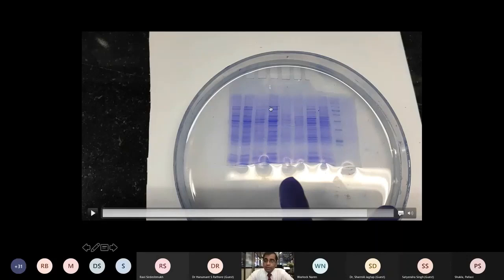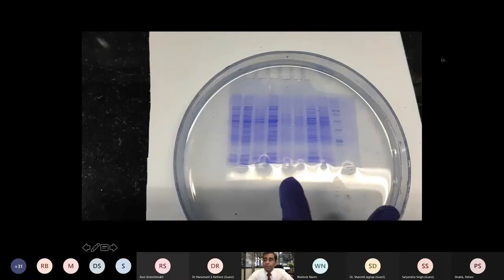As I said, I can make a lot of observations here: some of these extraction methods work very well, but this quantification is not good. This quantification is not good. There is no protein here. So either the quantification is poor or this method has not worked. So accordingly, we can either re-quantify or try out newer methods as well. Quality control checks are very crucial to make sense whether we are going ahead or we should take a step back and just try out new things.